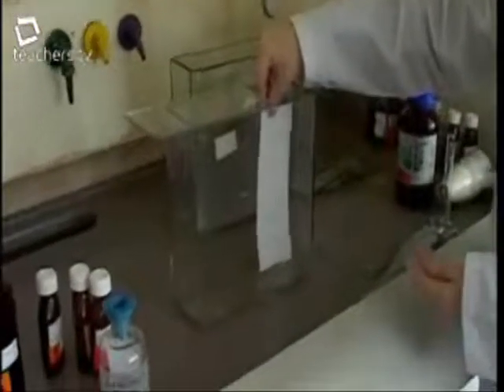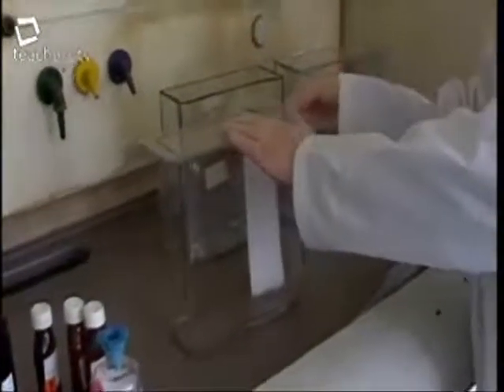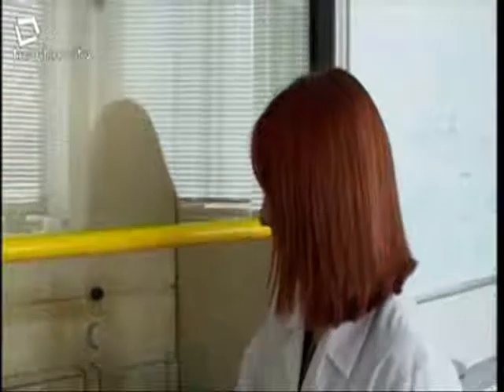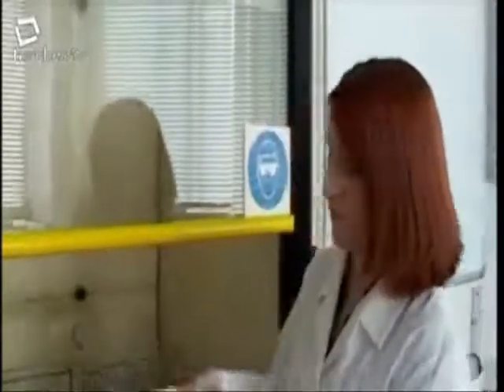We basically place the plate into the tank, ensuring that the solvent is actually covering the bottom of the plate, and then we seal the tank. As the solvent rises up the plate, it carries with it the component dyes. Some dyes are more strongly attracted to the plate than others and are held back. Take the plate from the tank. You can see just by looking at it, the 5 spots for the crime scene sample and the 5 spots for the suspect sample are identical, and this is another piece of good corroborative evidence.